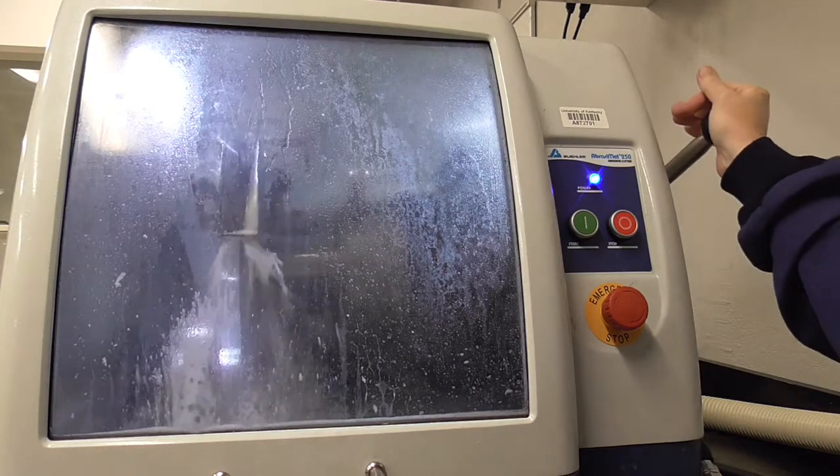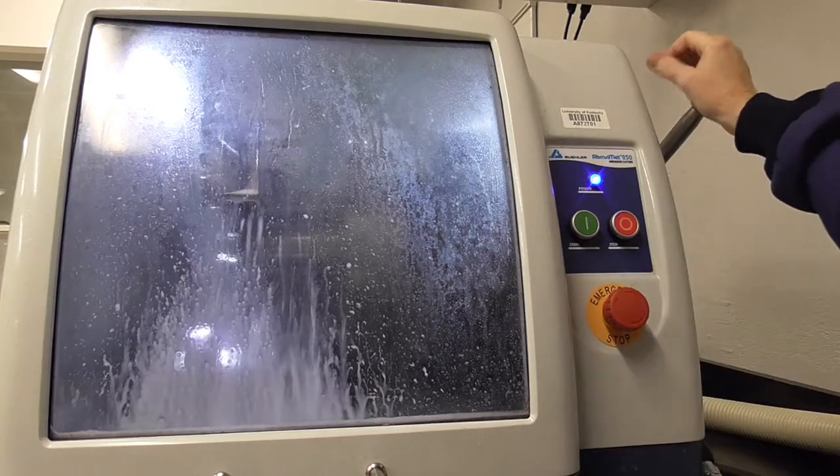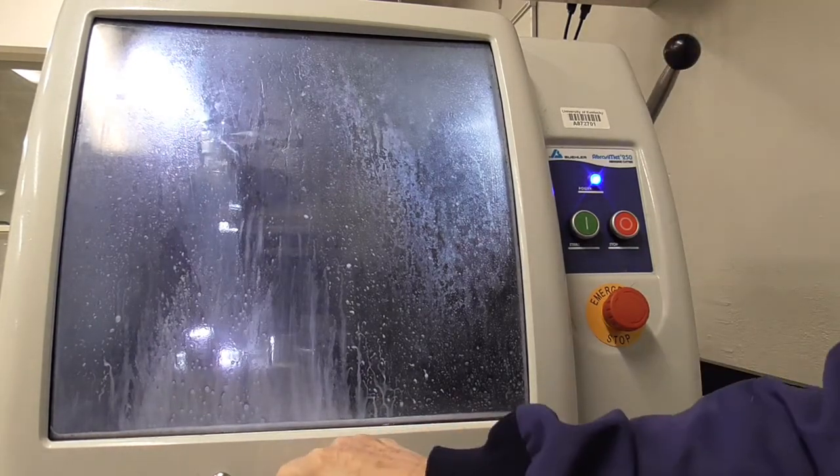You continue slowly moving down through your sample until the resistance or noise stops. Then you lift your lever back up, hit the stop button, and now you can enter the saw.